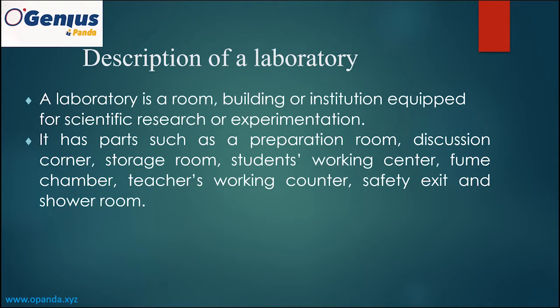It has parts such as a preparation room, where you can prepare your reagents such as solutions or solids, a discussion corner, a storage room, a students' working center, where the students can work on the assigned experimentation, and a fume chamber.